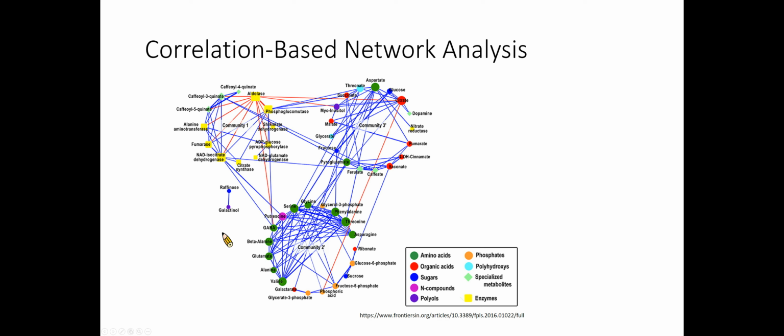Unlike pathway analysis, the correlation-based methods build a metabolite network according to the relationship patterns observed in the experimental data. In the resulting network, each metabolite is represented by a network node. But in contrast to pathway analysis, the link between nodes represents the level of mathematical correlation between each pair of metabolites. In metabolomics data, high correlation coefficients are frequent due to the presence of systematic and indirect association.